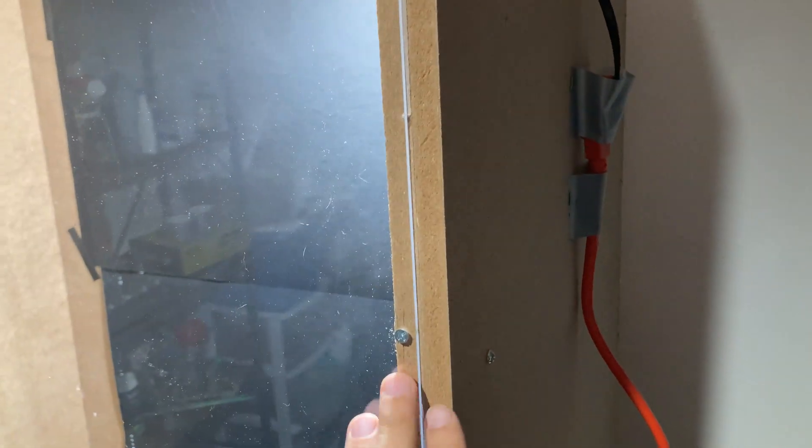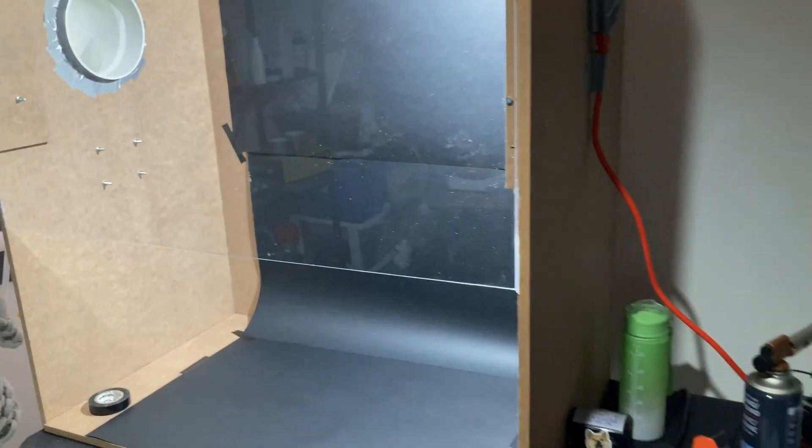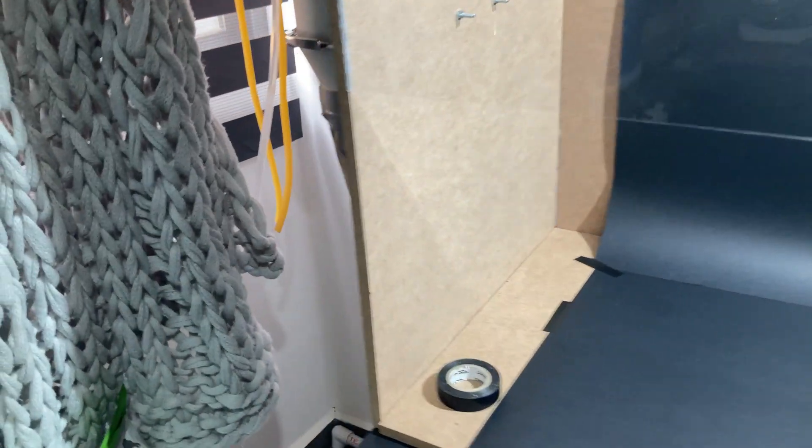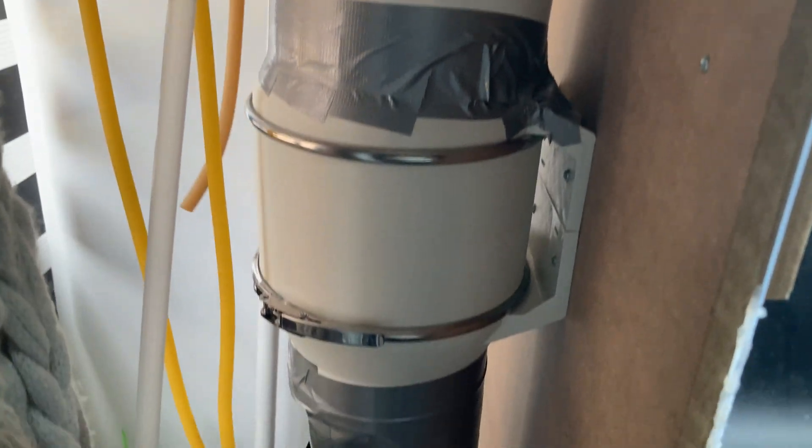Let's take a closer look at my fume hood. First off, the materials — my hood is made from cheap particle board, some plexiglass, and PVC pipe. It has a powerful 5-inch fan and an LED light.